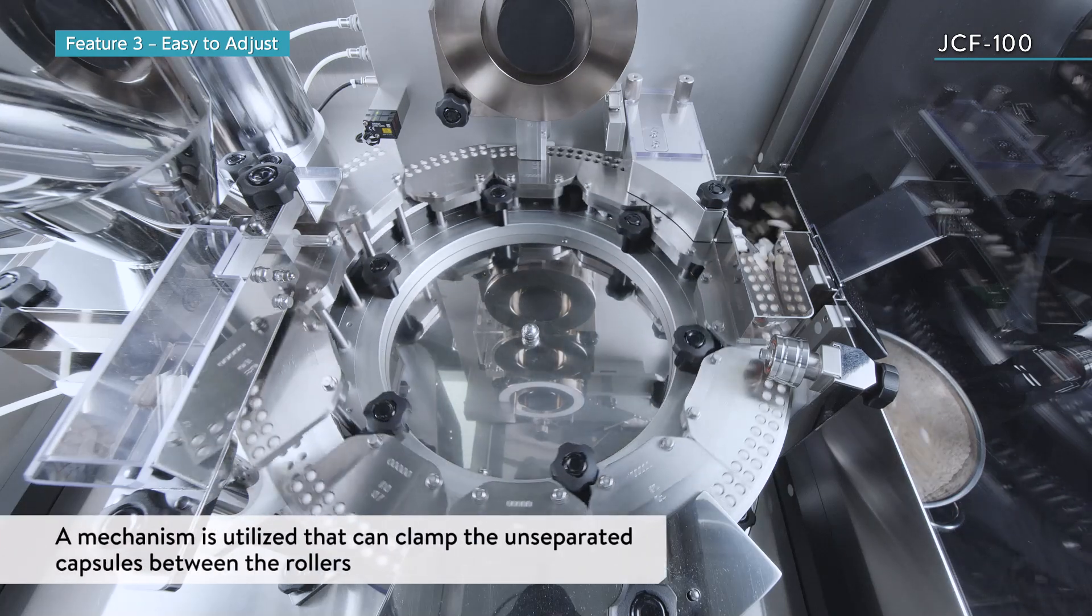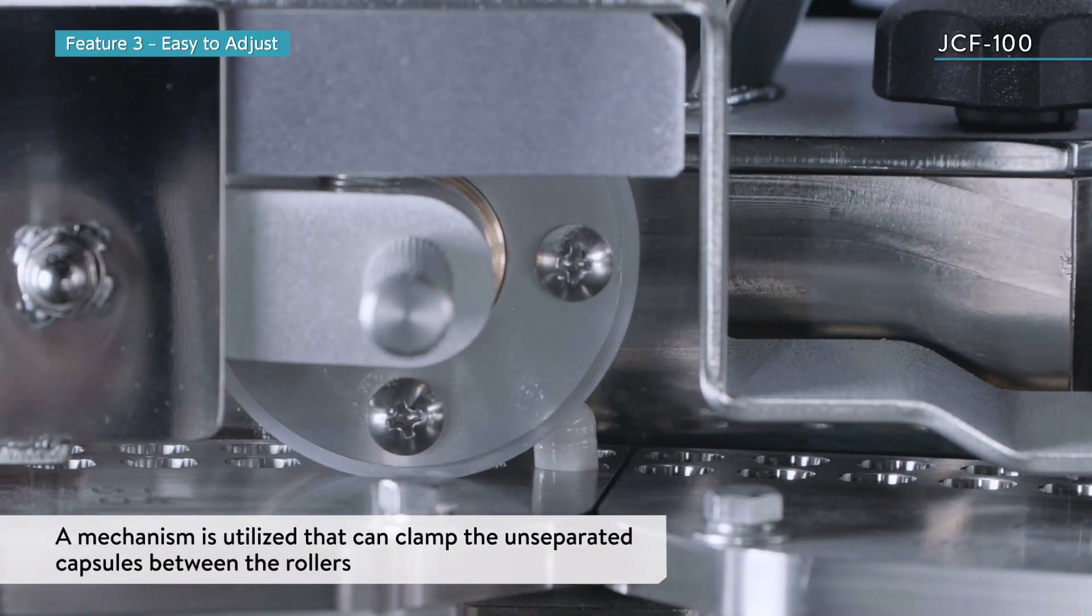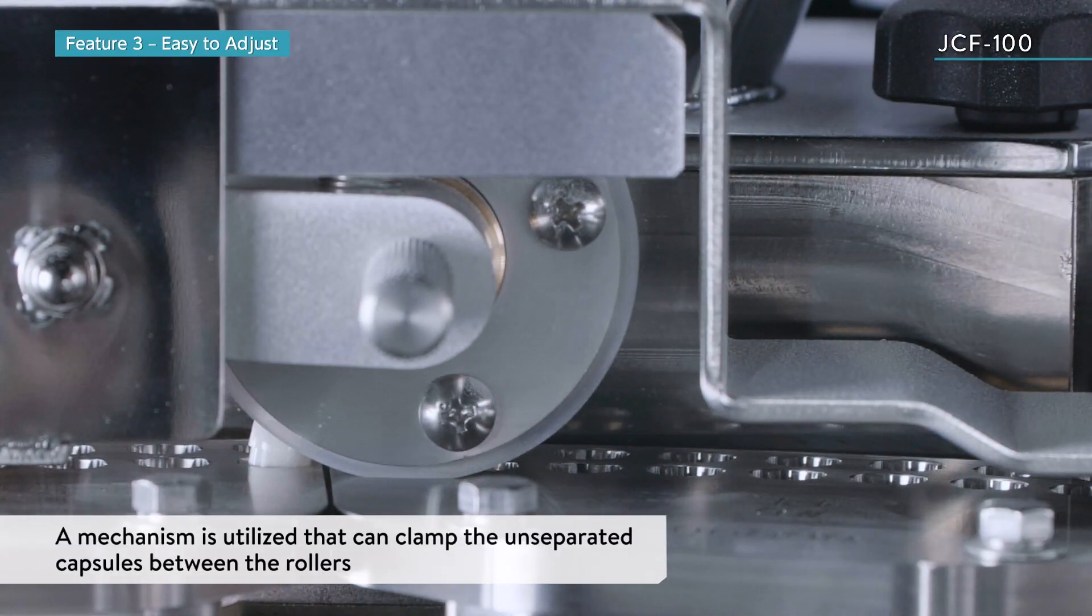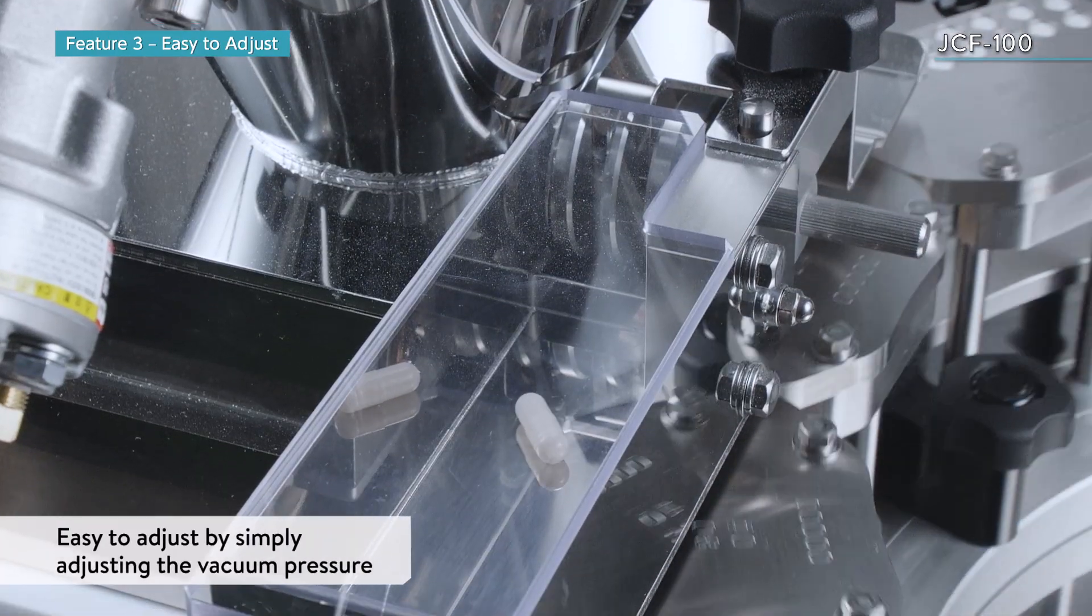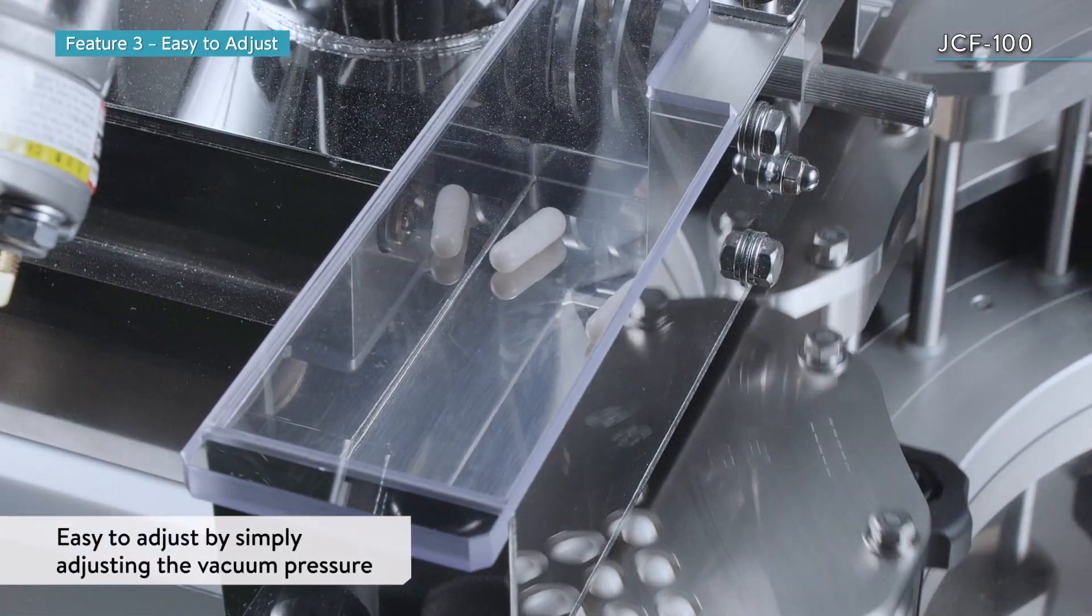The JCF-100 utilizes a mechanism that can remove the unseparated capsules by clamping them between the rollers. This ensures that defective products can be removed with simple adjustments, even during high-speed operation.